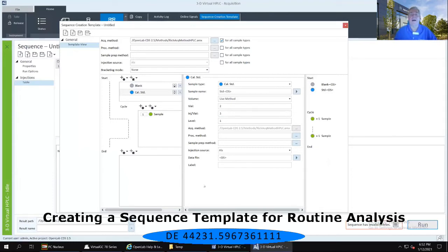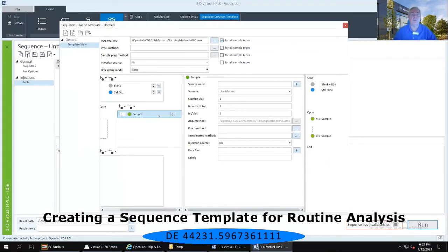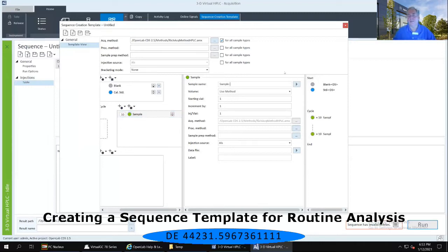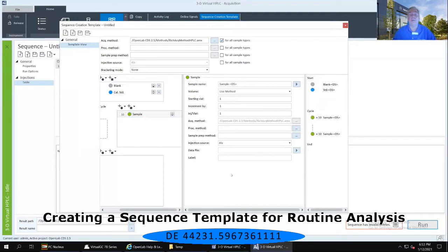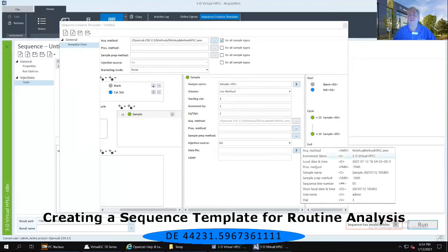According to my SOP, after my blank and calibration standard run in triplicate, I can run up to ten unknown samples. In the cycle portion of the lower left-hand panel, I'm going to click that sample type, which has a green icon associated with unknown samples, and change that one to ten. In the middle frame, I'll label my samples 'sample dash', and using my right-facing arrow, short local date and time. I've already used vial position one for my blank and two for my calibration standard, so I want this starting vial position to be number three and increment by one. Finally, for the data file, using that right-facing arrow, the data file name will be the same as my sample name.